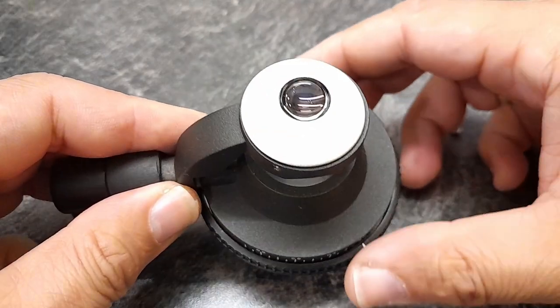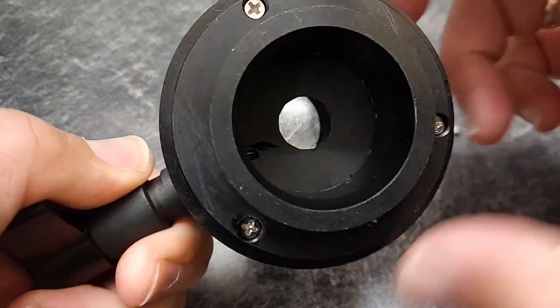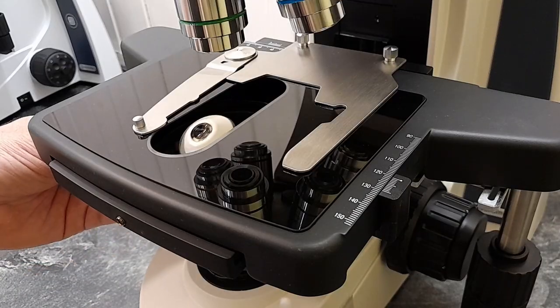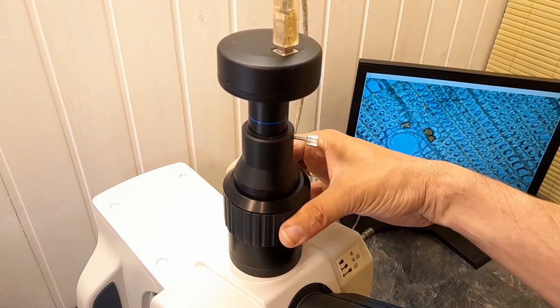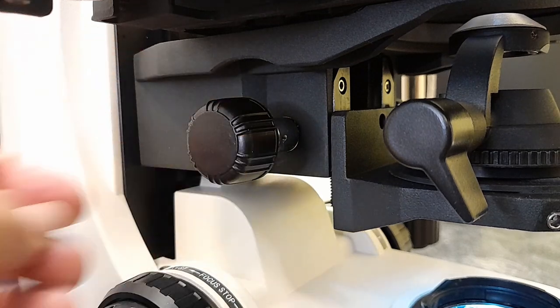The provided condenser is a so-called swing-out condenser. And better microscopes have those swing-out condensers. And this means that by flipping over a lever, you're able to remove or to swing out the top lens of the condenser. And this is important, especially if you want to get a large field of view with a four times objective. So you can swing it in and out quite easily this way to ensure that you always see the maximum amount of the specimen. And the photo tube also can be focused. There is a ring here that can be rotated and this raises and lowers the camera. So to be able to make sure that the focus of the image is the same as the focus in the eyepieces. The condenser can of course also be raised and lowered and it is possible to use the provided tool to center the condenser. This is again important for Kohler illumination, which is the next thing that I would like to talk about.